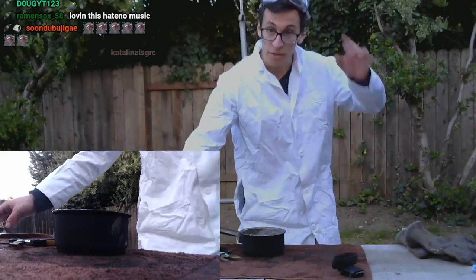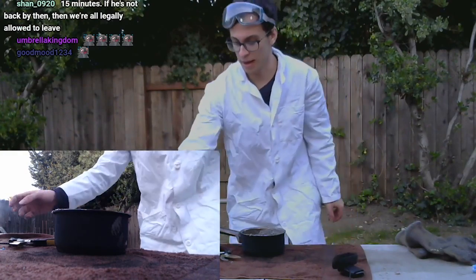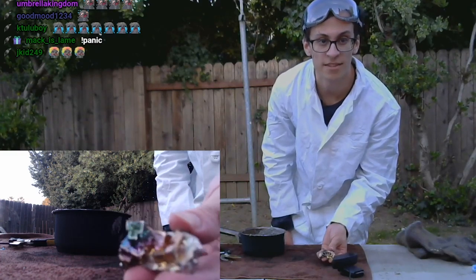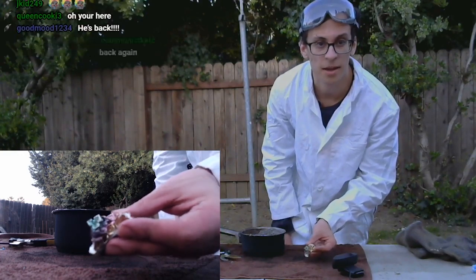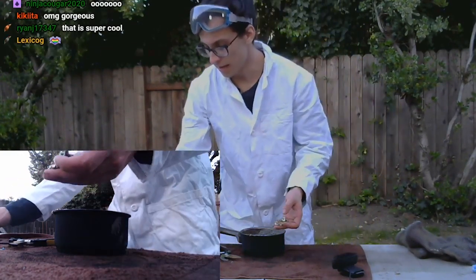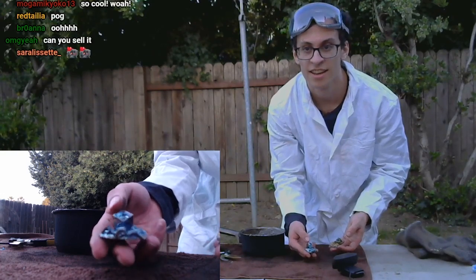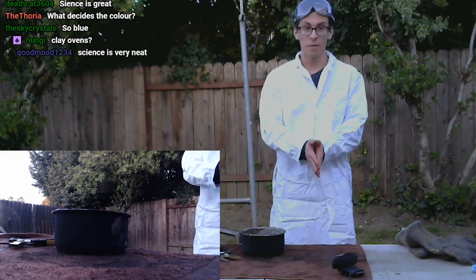I've got some examples of previous batches of bismuth that were actually really good. This is my favorite one personally right here — it has every single color of the rainbow on it. I showed this a little bit on stream. Another one right here really exemplifies the cube structure you can get. This is bismuth crystals.